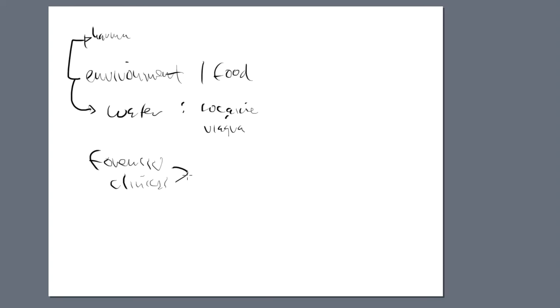A lot of these drugs we can just shoot onto an MS and figure out if they're present, and then figure out the concentration of them, either in blood plasma or saliva, or that's spit, or in urine. So those are other options that we can do with an MS that have some applicability.